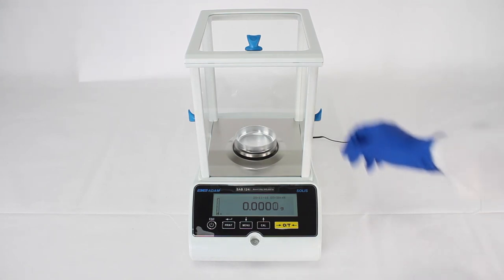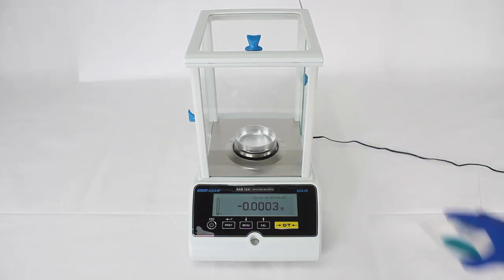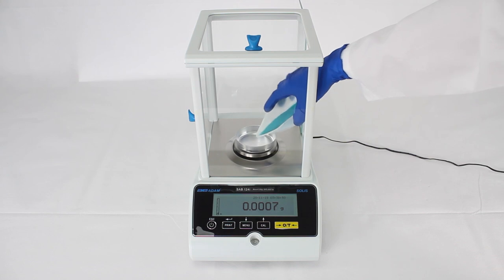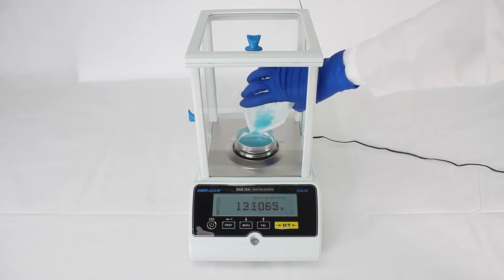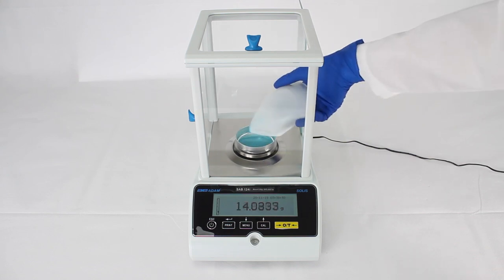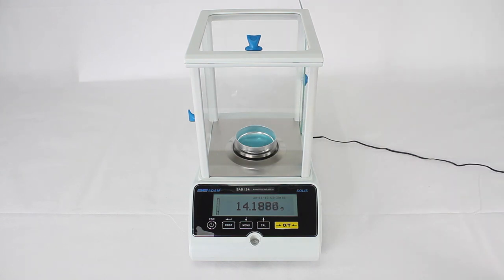Semi-micro, analytical, and milligram models have draft shields with sliding glass doors. This boosts accuracy by eliminating the effects of breezes and reducing static electrical interference with the balance.